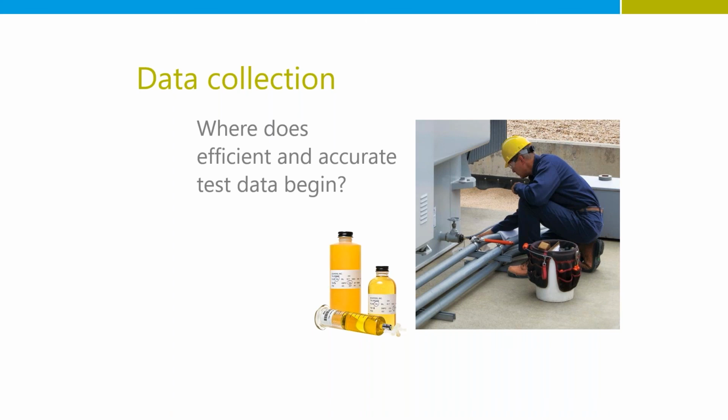And additionally, just to reiterate what Bill had said, having a solid foundation of that data available is going to make the rest of the process go much smoother. And then if you can keep that data in your system and reuse it for future analysis and/or to help with future data collection, such as maybe equipment information, and keep that stored and associated with your samples, it's going to be much easier for you in the future.